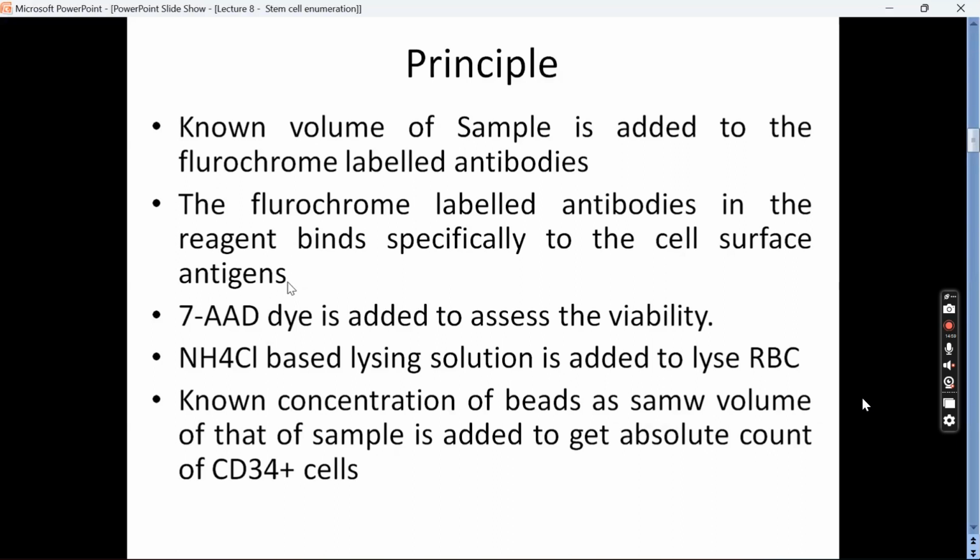Yes. So basically, as I told you in the introduction, this is one of the most sensitive flow cytometry assays, because the count you're going to give matters much to the clinician as well as the patient care. Leukemia and lymphoma is a qualitative assay, and CD34 is a sensitive quantitative assay. So you need to add a viability dye to exclude all the non-viable cells, which are not going to do the job for us, and enumerate CD34 in only the viable cells.